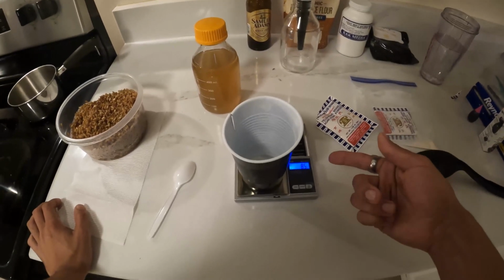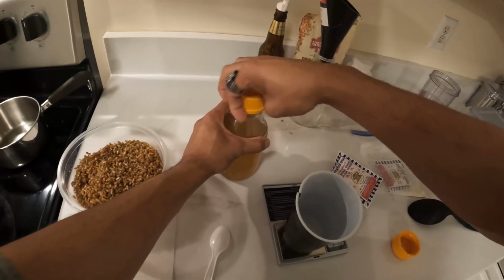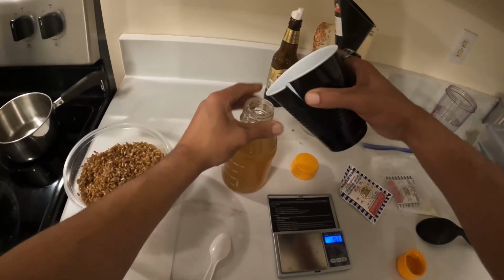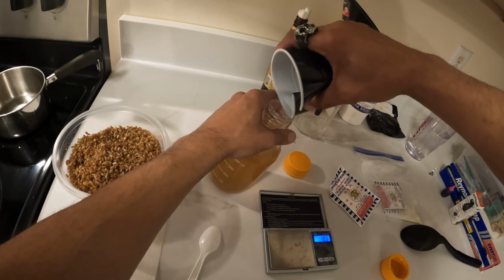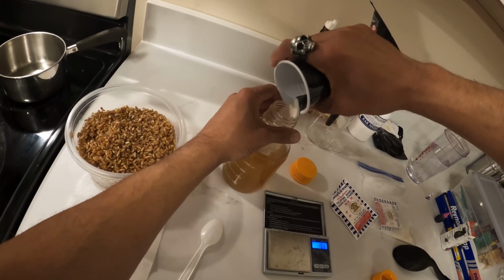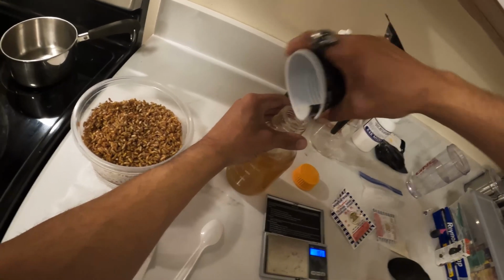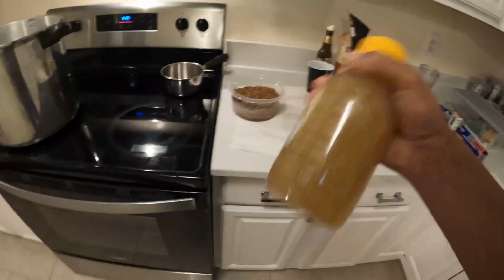So right there I've got 8.5, and we're gonna just go ahead and take that 8.5 of the agar and pour it in here. And what we're going to do with this particular one is we're going to put it in the microwave and bring it to a boil, and then we're going to shake it up some more.